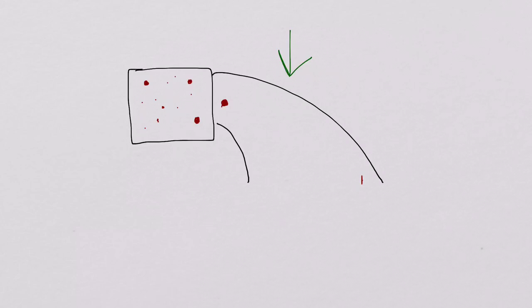If we instead imagine a lighter particle, and we can in fact just imagine the smallest type there, now as that particle flies through this chamber, that force is able to really affect that particle much more because the particle has so much less mass. So it's easier to push something small than it is to push something big. So this small particle will actually probably just get pushed very aggressively by that force and end up crashing somewhere in a much different place than where the heavier particle crashed. So essentially, heavier particles crash in a different place than the lighter ones do.